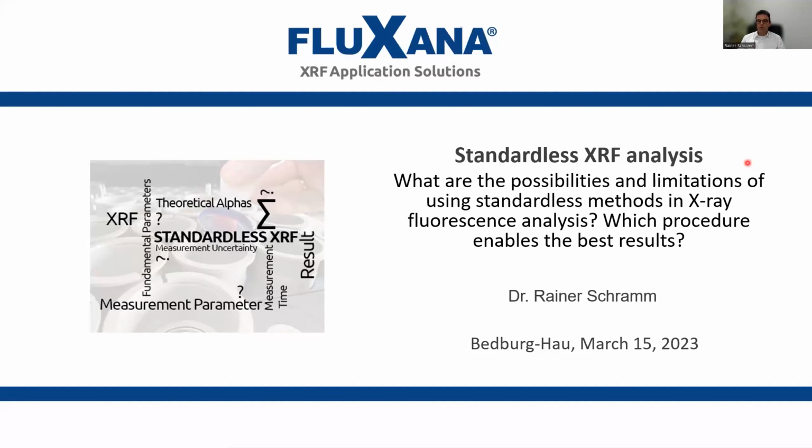The goal of my webinar today is to explain more deeply how such a method works and what its limitations are, so that you have a better understanding of how you can use your XRF without performing your own calibration.